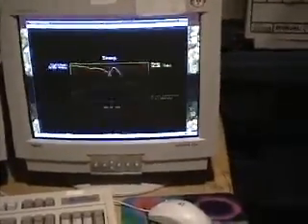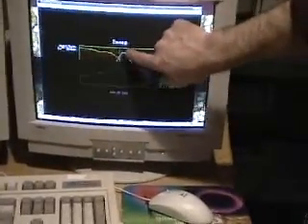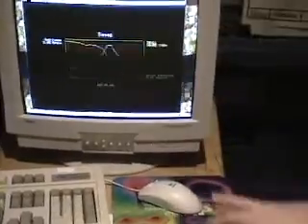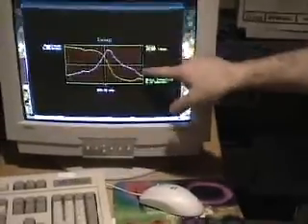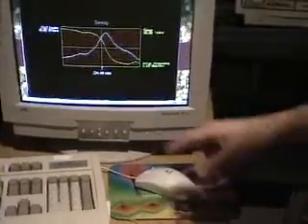And in fact, for the most part, what we pay attention to is the white curve, the amplitude versus frequency. So you might think, well, I want to be operating at this peak frequency right here. The actual frequency, so right now it's quickly sweeping the frequency over and over again and mapping out this trace for us about once every second.